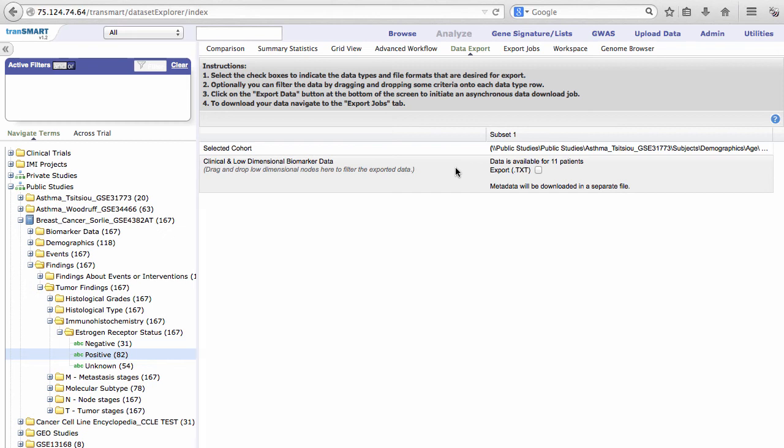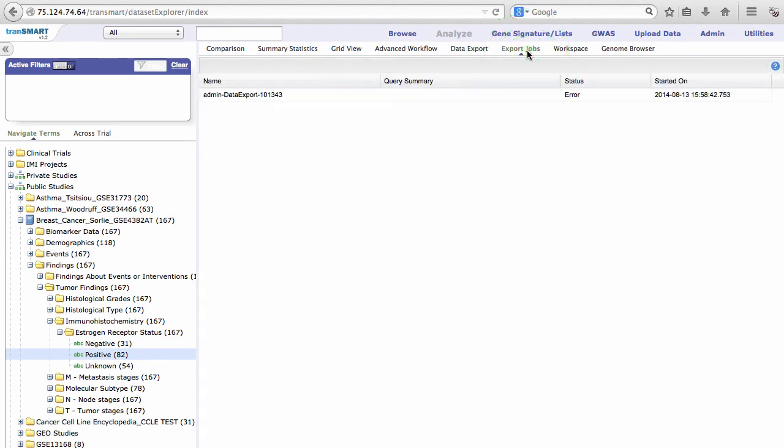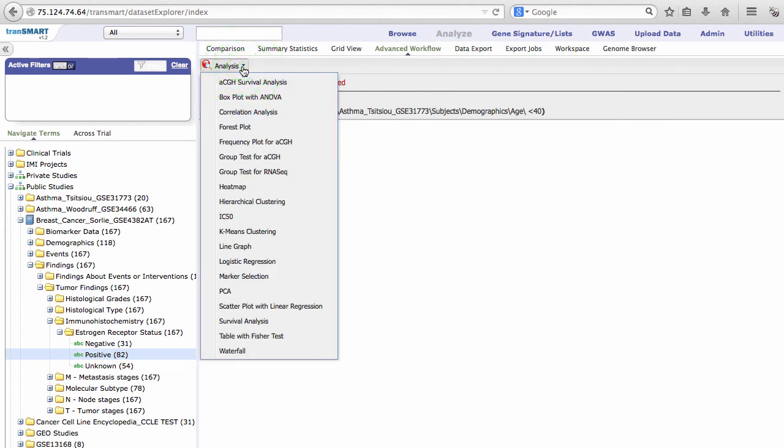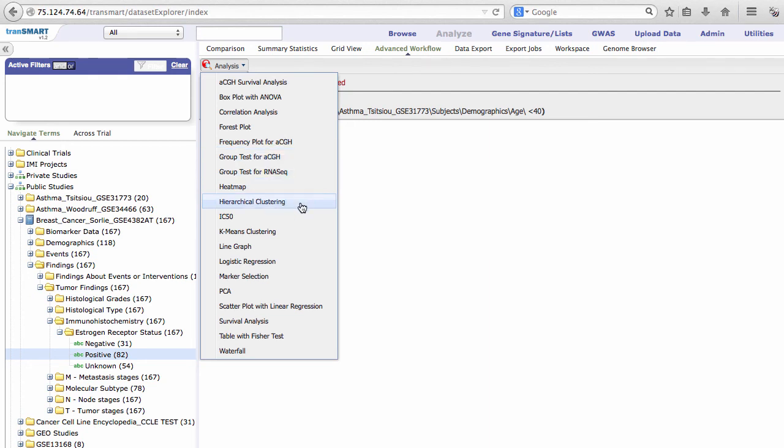You can view previous export jobs in the Export Jobs tab. Click on the Advanced Workflow tab. Click the Analysis drop-down. Notice that there are new analysis options, including forest plot, frequency plot for array CGH, group test for array CGH, group test for RNA sequence, and logistic regression.